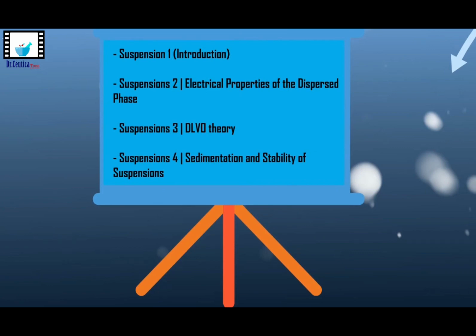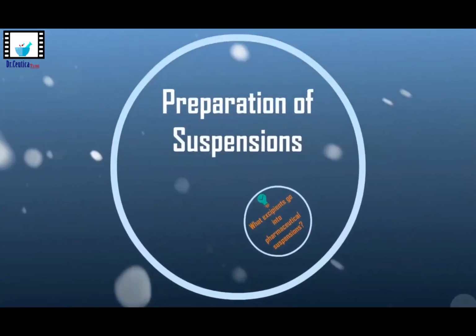In this video, we will look into how to prepare suspensions in the lab or extemporaneously.